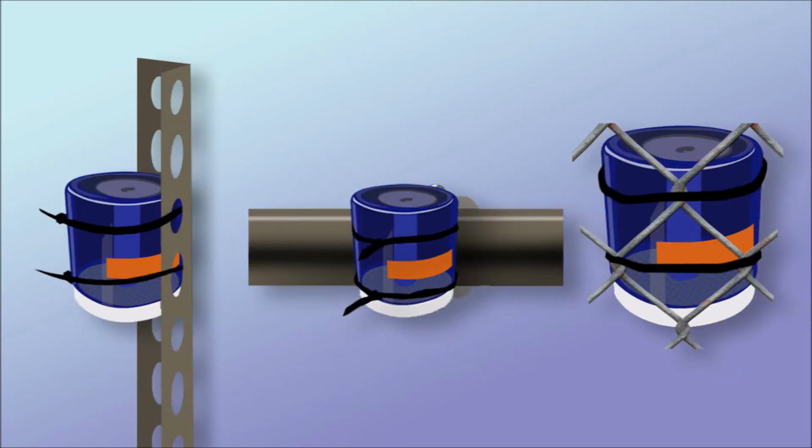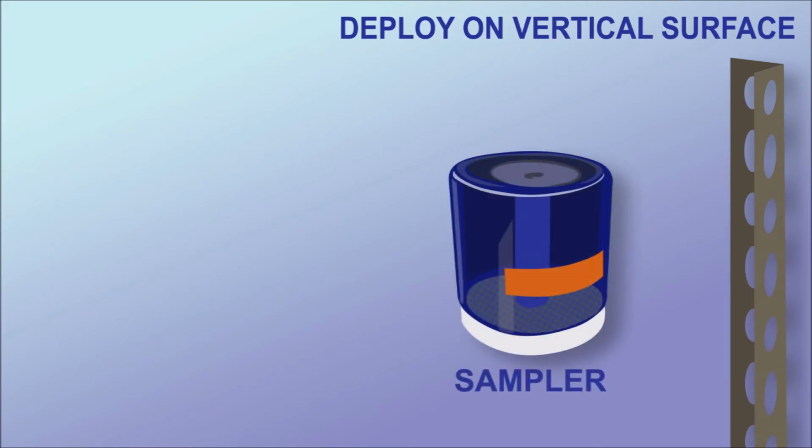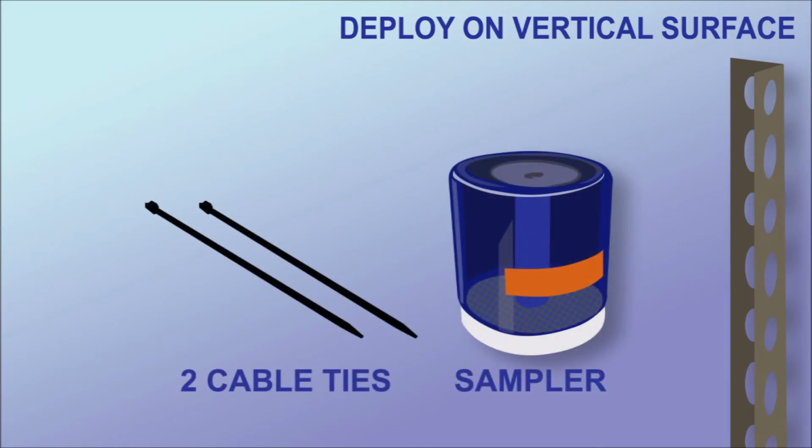Use one of three methods to deploy the sampler, depending on whether you have available a vertical surface, a horizontal surface, or a mesh fence. To deploy the sampler on a vertical surface, you will need the sampler and two cable ties.